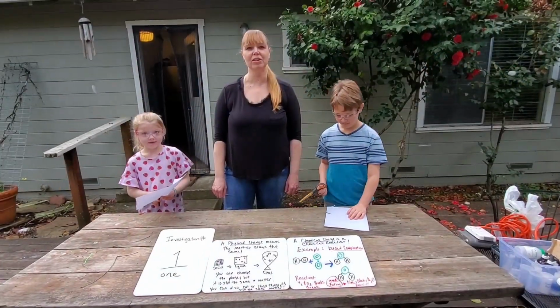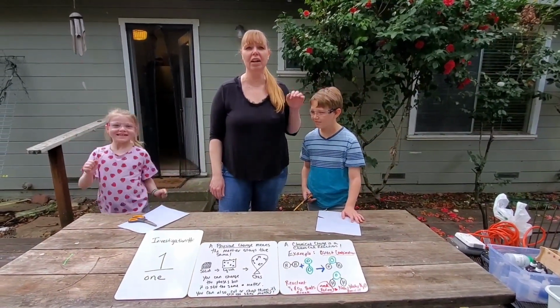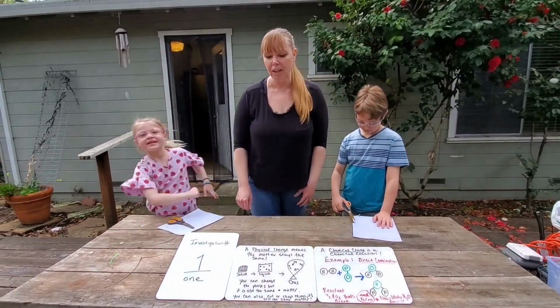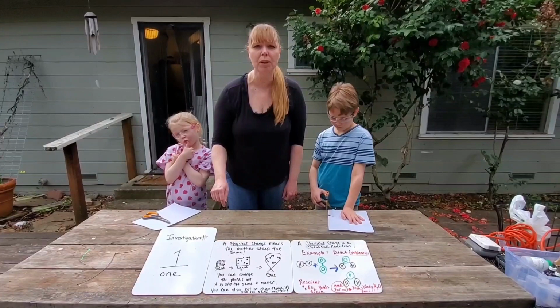Hi, chem students. So today I have helpers. I've got Jewel and Troy, my kids, going to help us investigate 13 different things today. And your goal is to just identify if it's a physical change or a chemical change. We're just going to go through all 13 super quick for you.